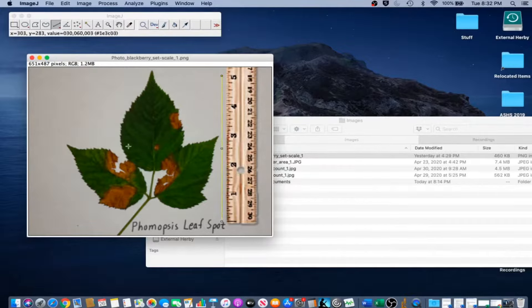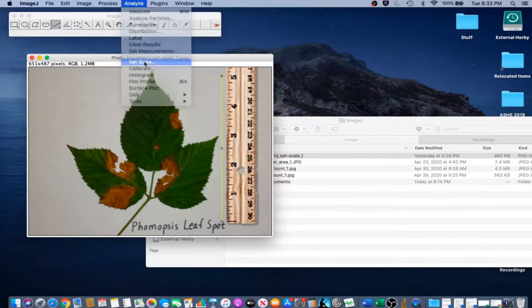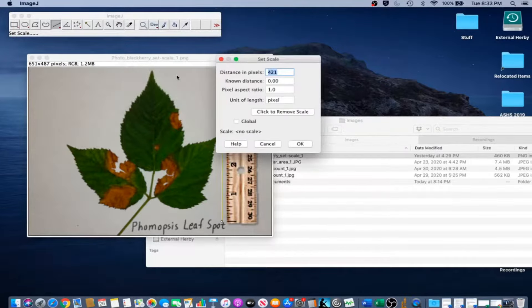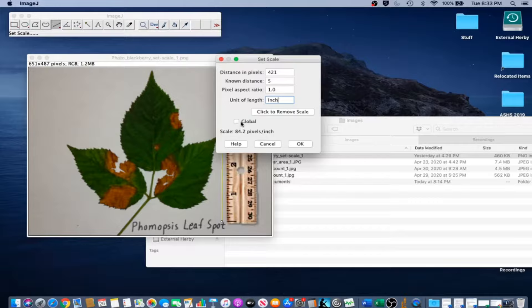Now that the file is open, select the Straight Line tool from the graphical user interface. Draw a line to an object of known size — in this case the 5-inch ruler — holding down Shift to keep the line straight as you do it. Go to Analyze, Set Scale. To set the scale of the line you just drew to 5 inches, change the known distance to 5 and the unit of length to inch. Notice the global box as well. When the global option is checked, the same scale will be applied to all images opened after this, until ImageJ is quit or a new scale is set. This can be useful if a whole set of images were taken at the same scale. Go ahead and click OK.